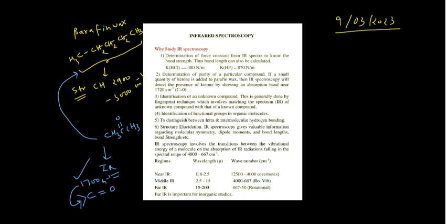What the fingerprint technique generally does is match the spectrum of the unknown compound with that of a known compound.